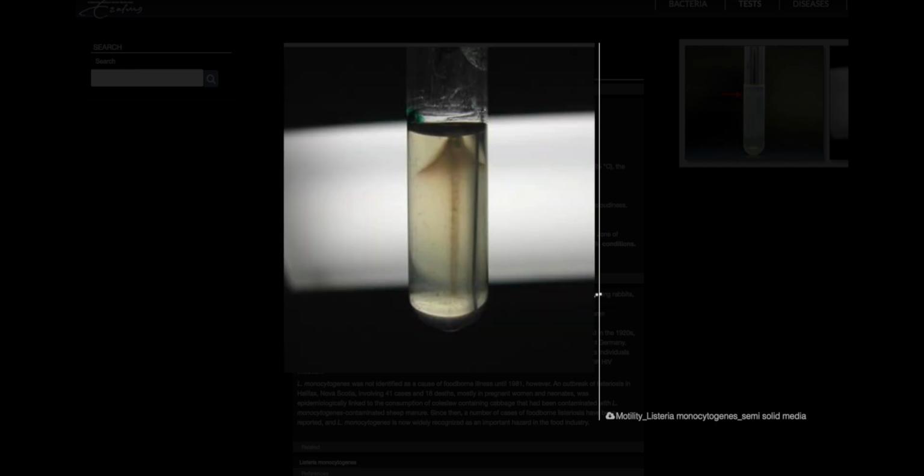At room temperature, 20 to 25 degrees Celsius, Listeria monocytogenes is actively motile. In contrast, at body temperature, 37 degrees Celsius, the organism does not synthesize flagella and therefore shows less or no motility. To test for motility, a semi-solid motility agar containing 0.2 to 0.4% agar is used.